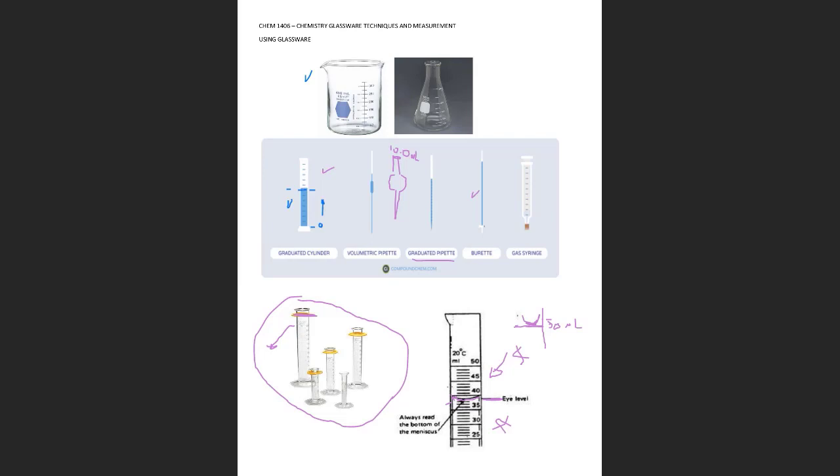and it has a scale. And then the Buret is a tube, and here it starts from 0, and the scale increases going down. So let's say here you have 10 mLs, and this is what you are going to use to do the density the second time. Okay, for now I think with glassware we are good. Any questions about glassware?